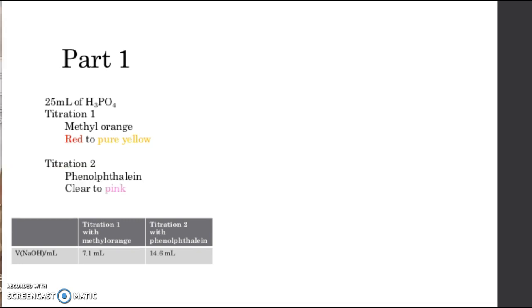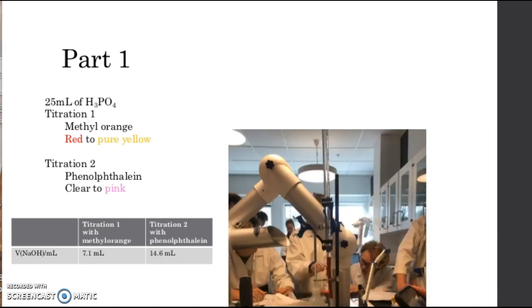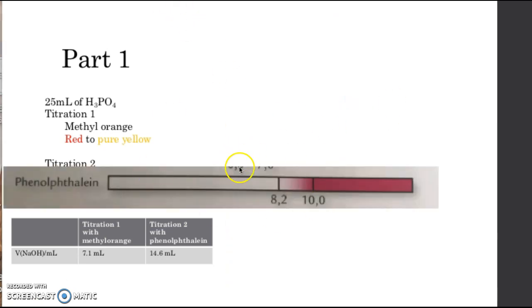In titration 2 we will add a couple of drops of the pH indicator phenolphthalein. As can be seen on the flask, it goes from a clear and transparent solution to a pink solution. This color change will occur when the pH value of the solution goes to 8.2 to 10.